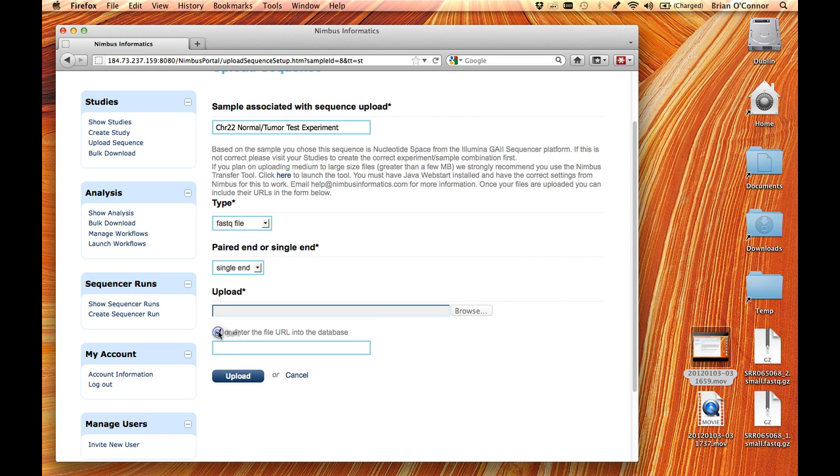And then finally, what actually is a very good option is if you can put your data set in a public place or a place that we can access on S3, you can actually just upload a URL here. And I'll show you in a minute how you're actually going to be using this upload client to upload the data, but you're actually going to be coming back to this form here to put in the URL. We're actually doing a two-step process.